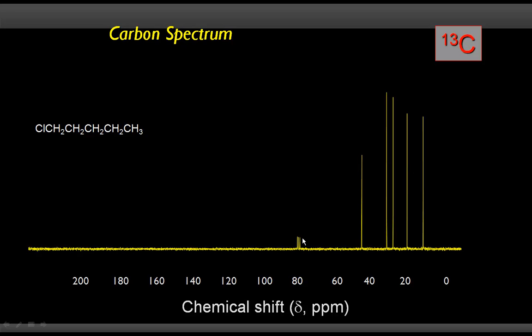Deuterium has some coupling to carbon-13, and that's why the carbon of CDCl3 comes as a triplet in C13. It doesn't show up in proton NMR, but it comes as chloroform in proton NMR. H is seen in proton NMR, but D is seen in carbon-13. The deuterium frequency is much closer to the carbon frequency, I guess. So the deuterium residual peaks can be seen in carbon-13 NMR.